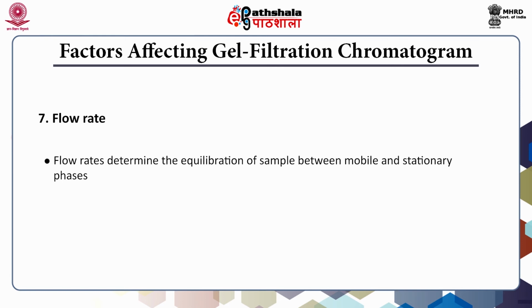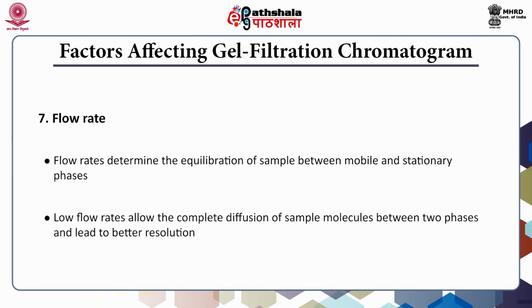That is why we have to use the optimum flow rate for a better resolution, like in normal chromatography basics. So, low flow rates allow the complete diffusion of the sample molecules between the two phases, and it will lead to better resolution.